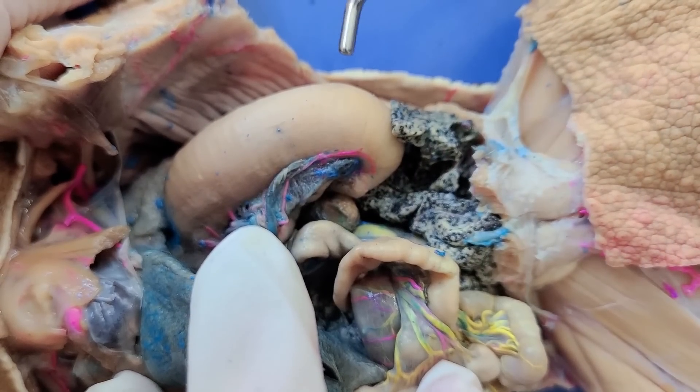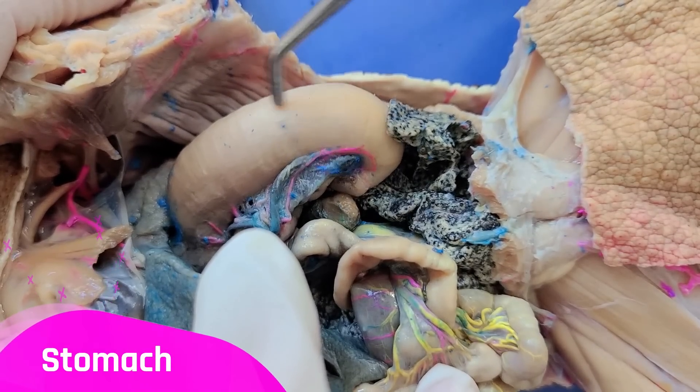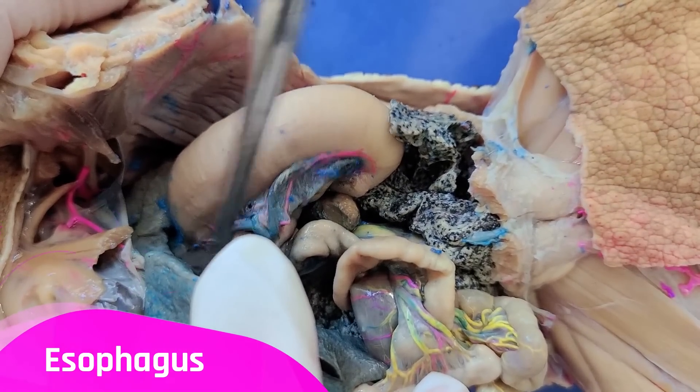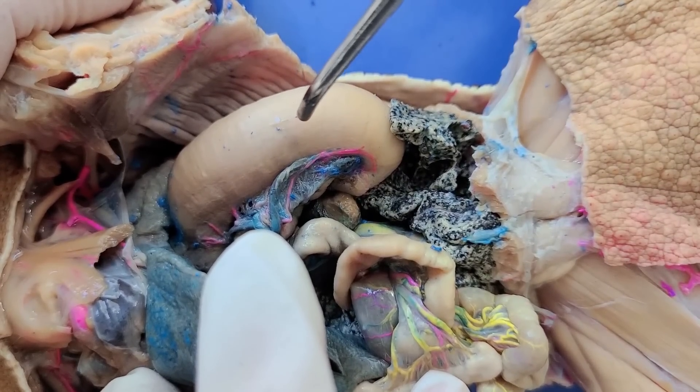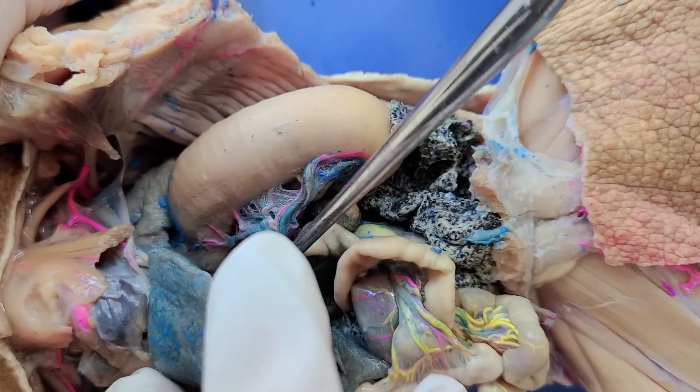Now below the liver, this J-shaped structure here is the stomach, which leads in from the esophagus up here. The stomach stores and digests food. You can also see these blood vessels supplying the stomach.